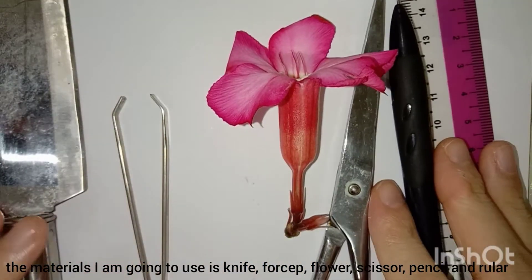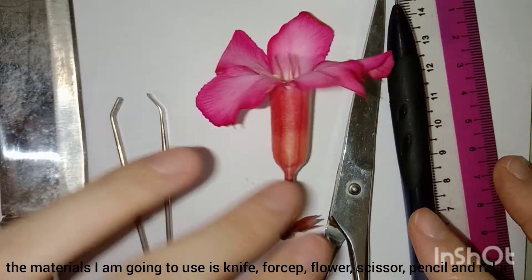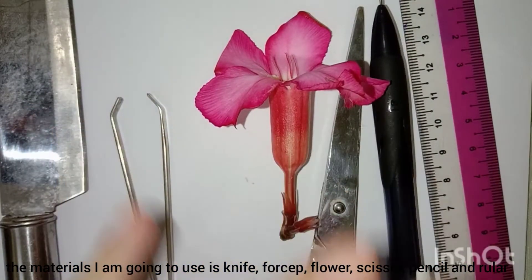The materials I am going to use are: knife, forceps, flower, scissors, pencil, and ruler.